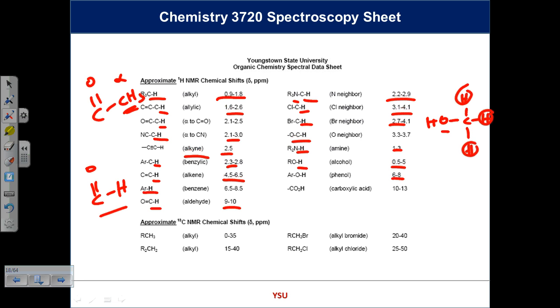Phenol, again, not so reliable, broad range. Carboxylic acid now, all the way downfield. That's probably the furthest downfield you will see, and that's because you're on a very powerful electron withdrawing group, and that signal is de-shielded to that extent. We will talk about C13 later in the week, and I'll do a similar sort of definition run so that we can see where these things come from. But those numbers now need to be understood, not necessarily memorized, but become familiar with them. Brianna?